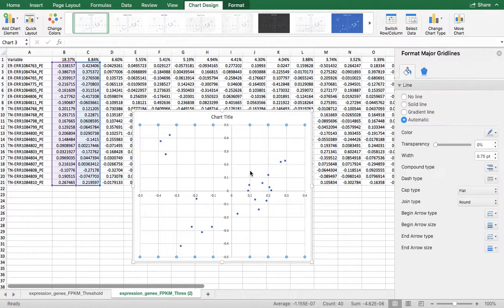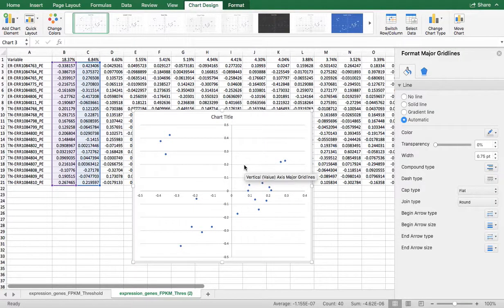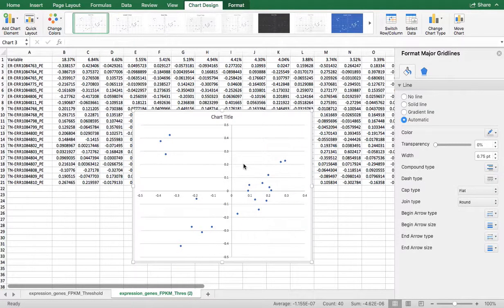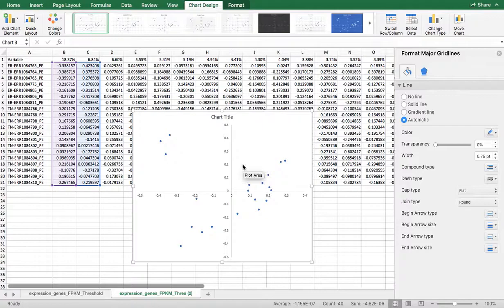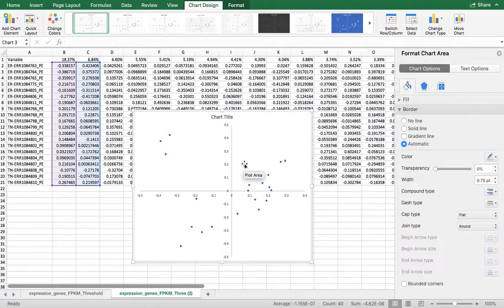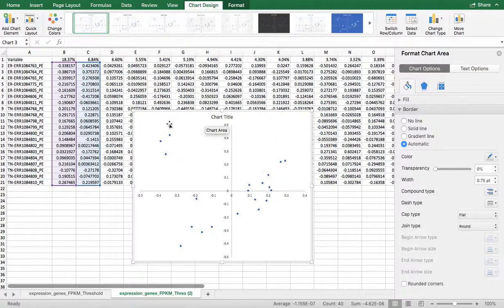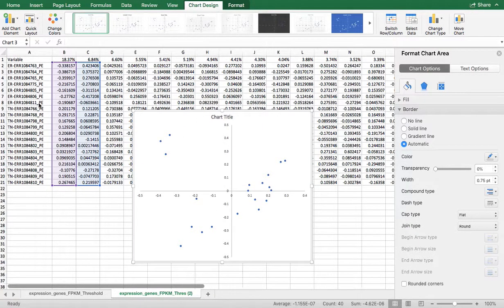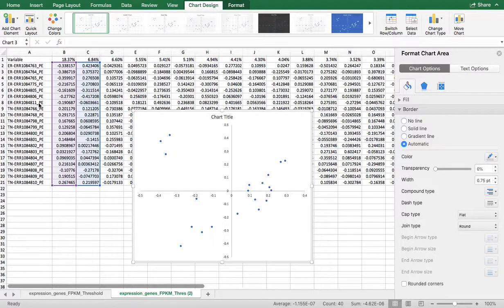Just to make this a little bit cleaner, let's get rid of these little things. Now we want to do a separation of these samples into where do I have my triple negative and ER positive. How do I do that?